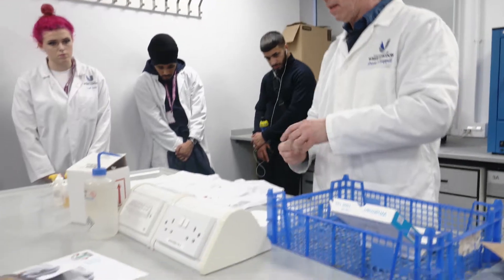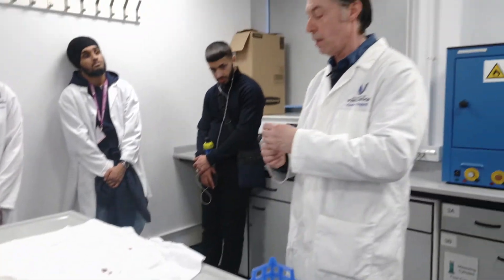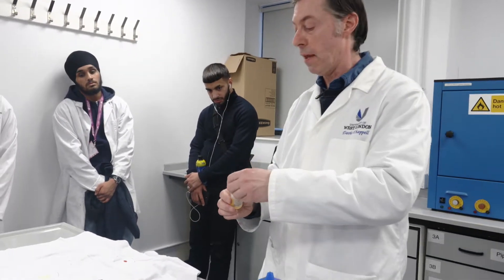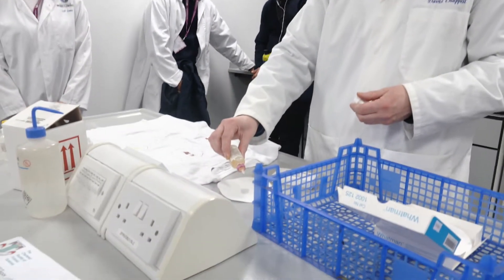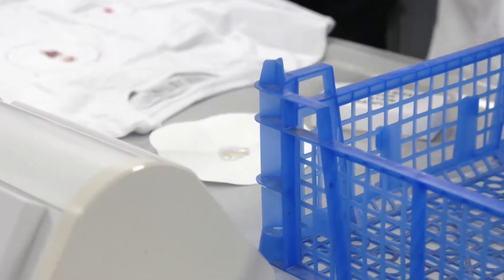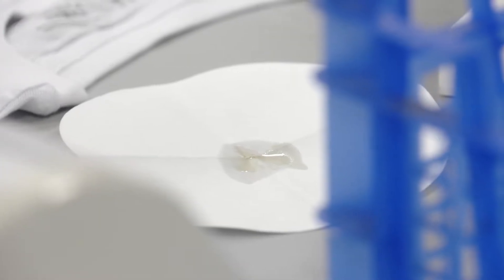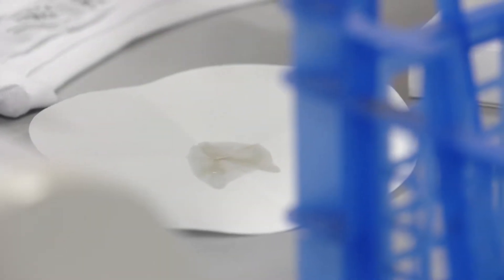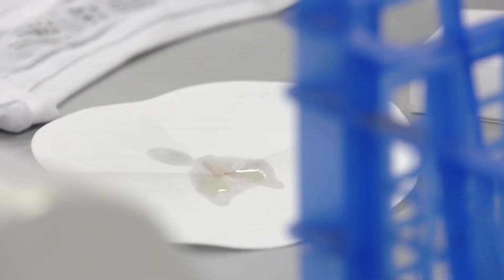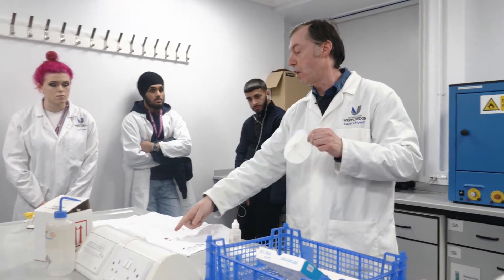So you put that on there. The second solution is an indicator and this will turn pink if there is blood. It shouldn't turn pink yet because we haven't done any reaction on it — you can see it's yellow. Then there's an oxidising agent which oxidises the haemoglobin and that gives the colour change to the phenolphthalein, which was the secondary agent. If there is blood, you see a pink colouration coming through — going from yellow to pink — and that indicates it is a blood stain.